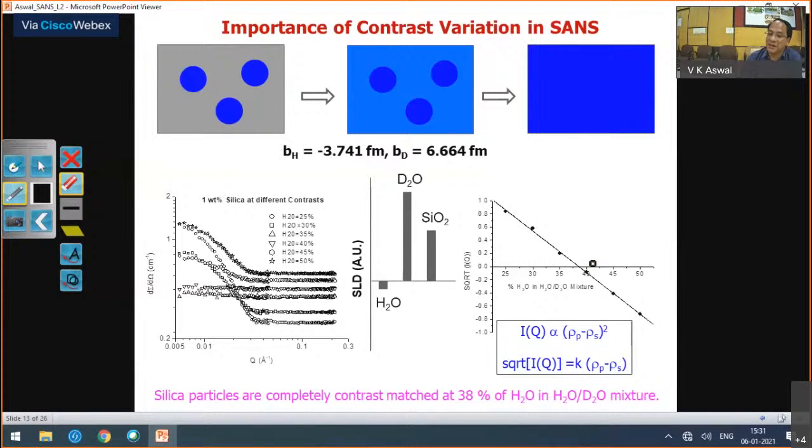So this is experimental verification, and it may happen that when you do it from the chemical compositions, you can get a number which is close to this. So always, if you can manage this, it is better to verify this experimentally.